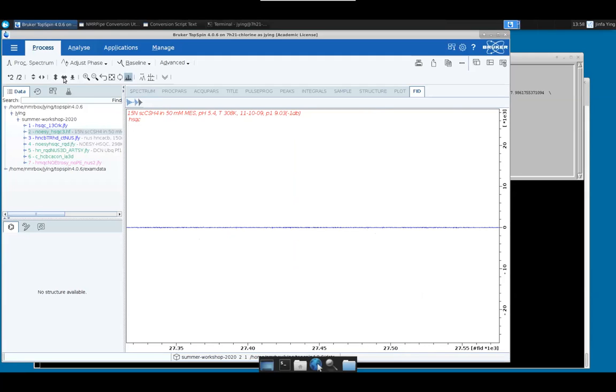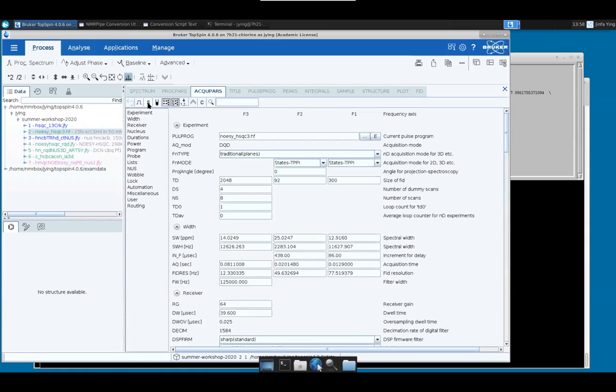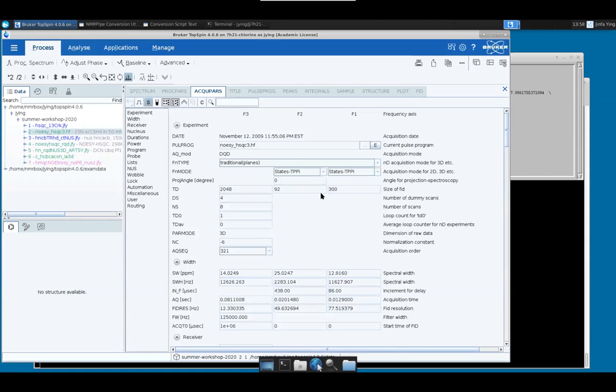How do I do this? Hey, Jinfa. Even in EDA, if you go to the status parameter, like if you say DPA, it shows the total. Same click will show that. Yeah, that's true too. I'm usually just working with the ACQUS file, and you can just grab that number.